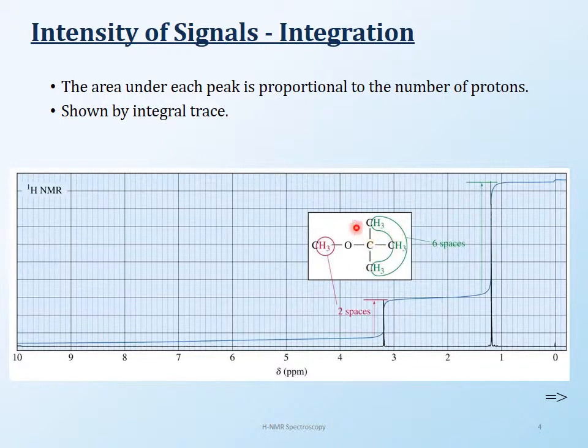This is kind of similar to the other spectrum that we just saw, where you have a T-butyl group and a methyl group. The methyl group is coming downfield shifted over here because of the oxygen, and the T-butyl group is quite shielded because of the electrons, and it's coming around 1.2 ppm. But of course this NMR is about showing you the integral that we can draw.